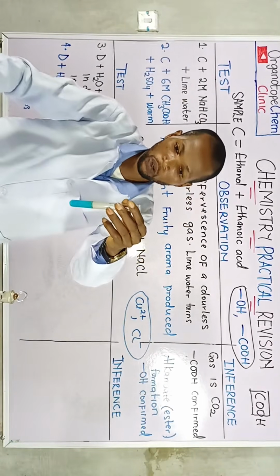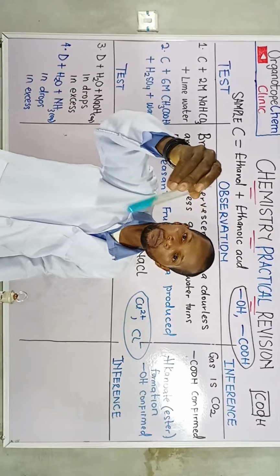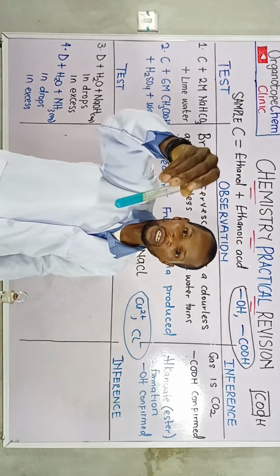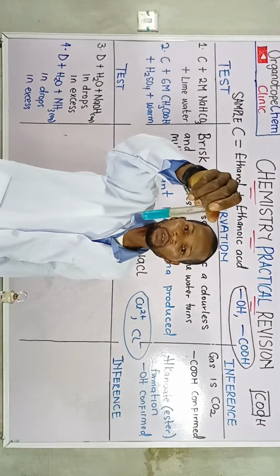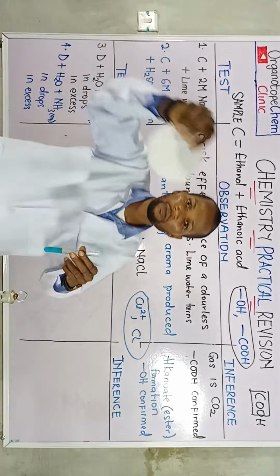Okay, here we go. Now the next thing is to shake properly. Assuming we are having a bigger container, we are expected to stir it. Can you see that it is actually soluble in water? Okay, it has dissolved completely in water. Assuming it is an insoluble salt, we are going to make use of this.